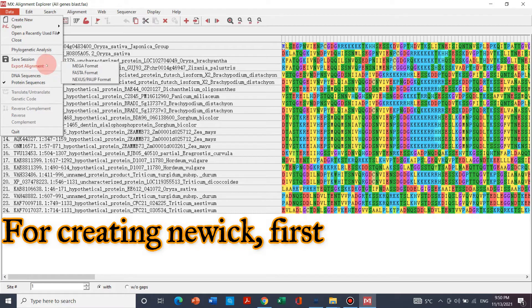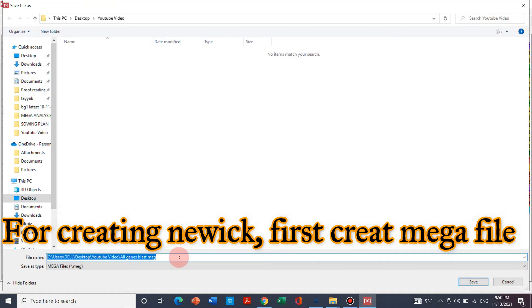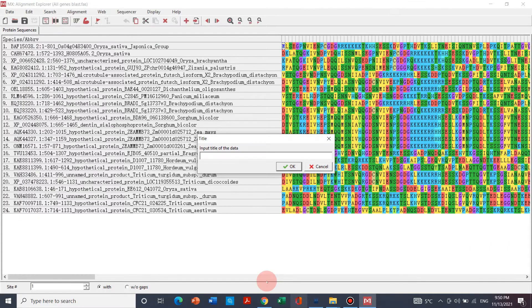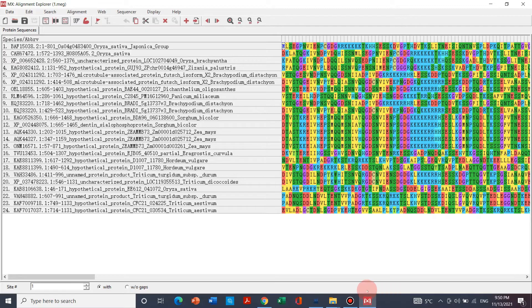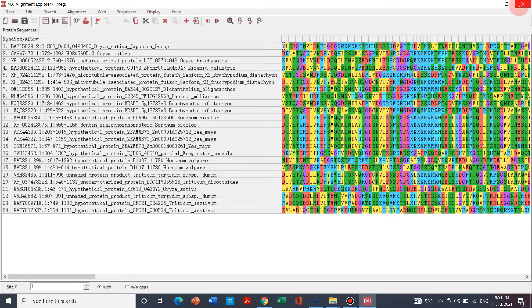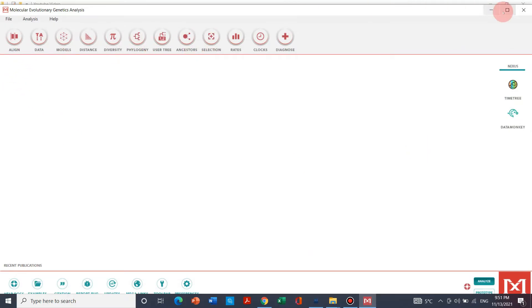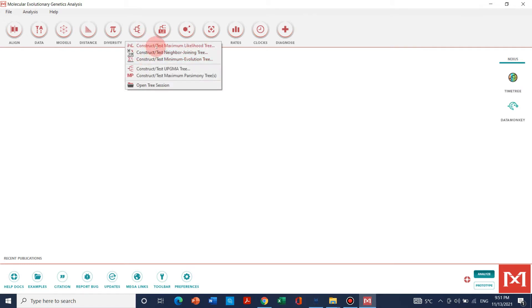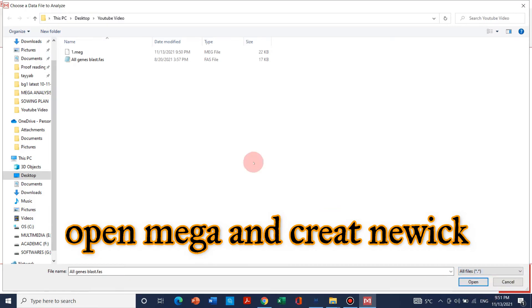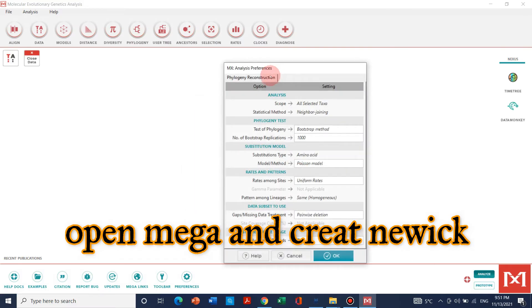For creating a new Newick file format, first you have to export this into Mega file format. We can save this into Mega file format — let's name it 'task one' and save it. Now our file 'task one' is saved. We can finish this and go to Phylogeny, click any method you like such as the neighbor joining method. Here you can choose your Mega file and click OK.